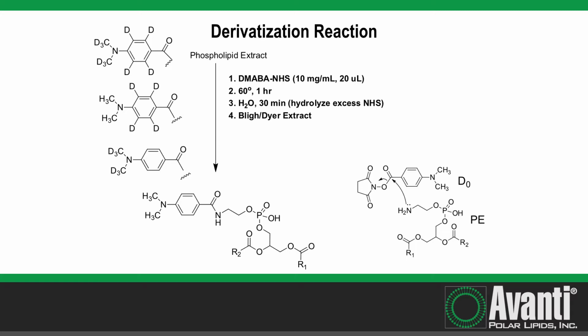And so the phosphatidylethanolamine indicated by this structure here, the lone pair of electrons, of course, attacking the ester derivative here, and this succinimide is a very good leaving group, N-hydroxysuccinimide is a good leaving group. And so we now have these amides, which are products with PE, and so they'll be labeled with either the D10, the D4, the D6, or non-deuterated.